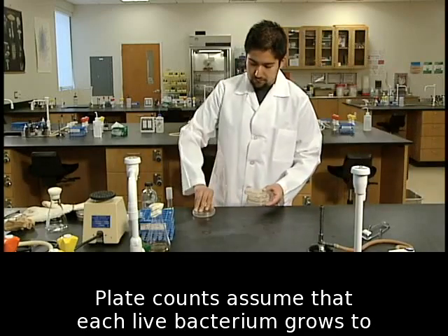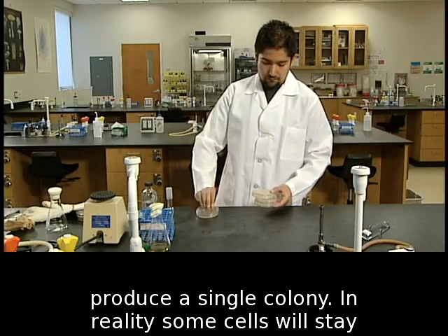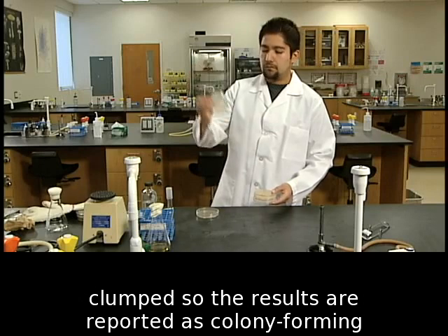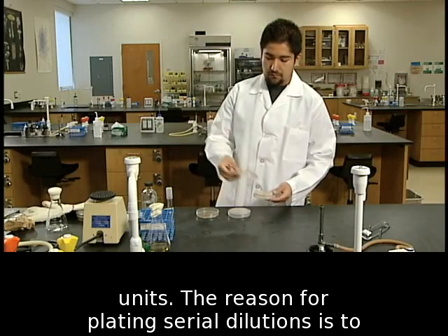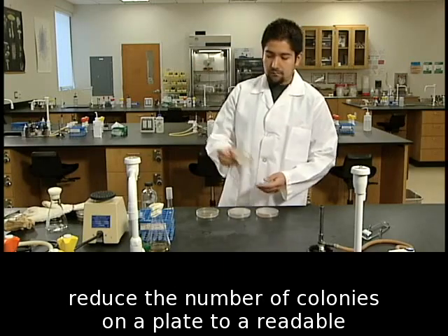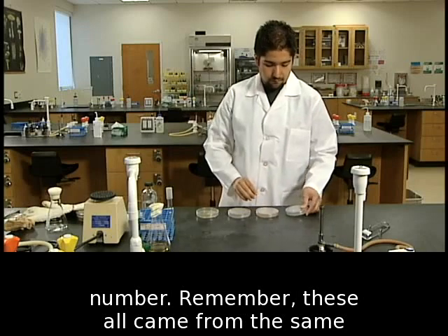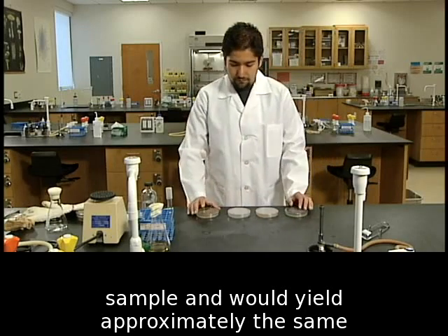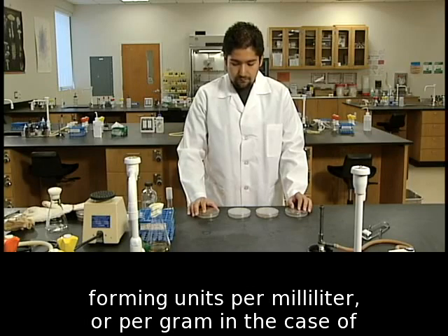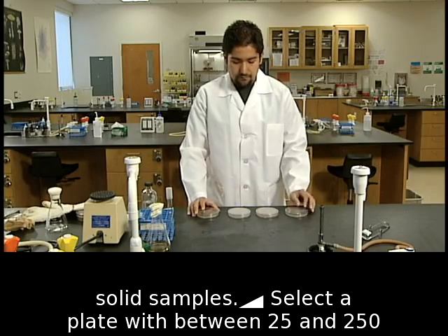Plate counts assume that each live bacterium grows to produce a single colony. In reality, some cells will stay clumped, so the results are reported as colony-forming units. The reason for plating serial dilutions is to reduce the number of colonies on a plate to a readable number. Remember, these all came from the same sample and would yield approximately the same number of colony-forming units per milliliter, or per gram in the case of solid samples, if you could count all the colonies.